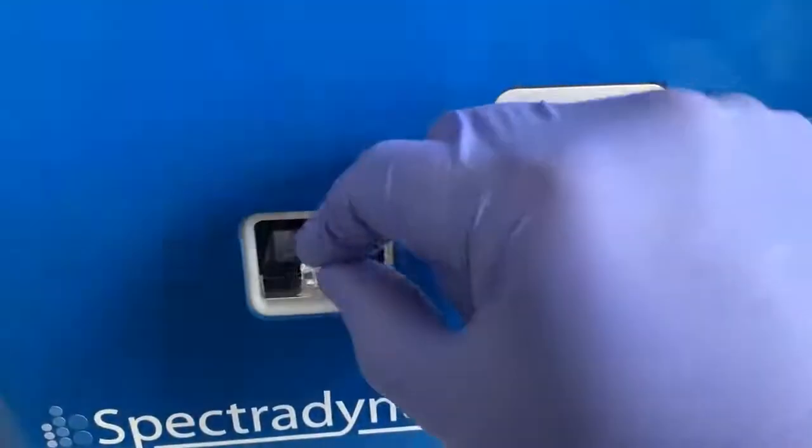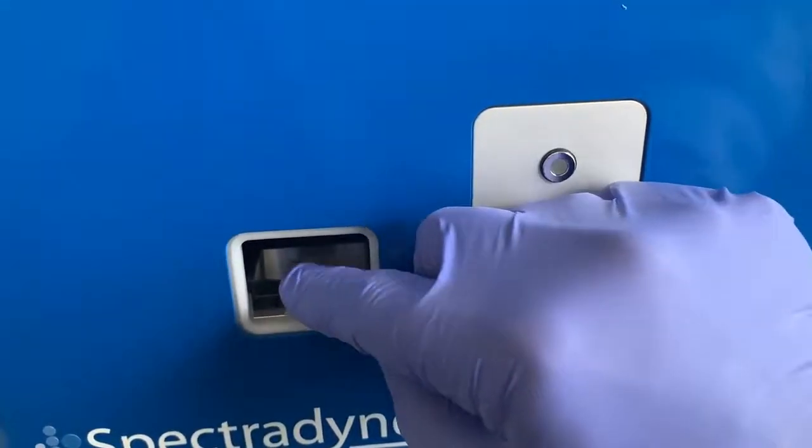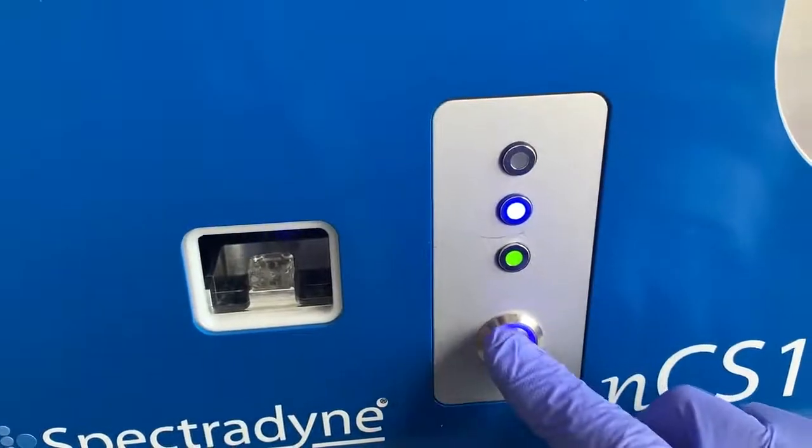Once the sample is in the cartridge, it's merely placed in the front of the NCS-1 and then raised up inside.